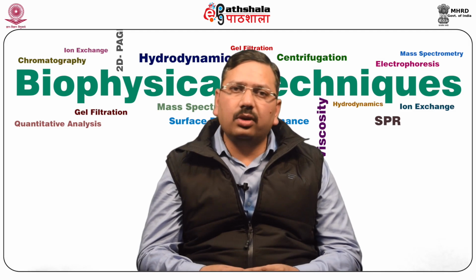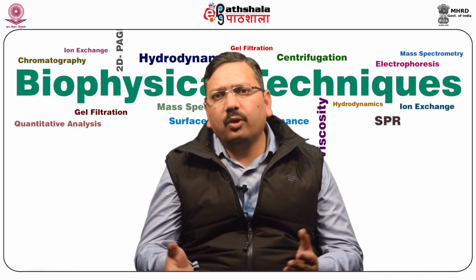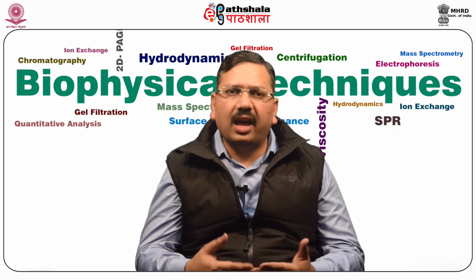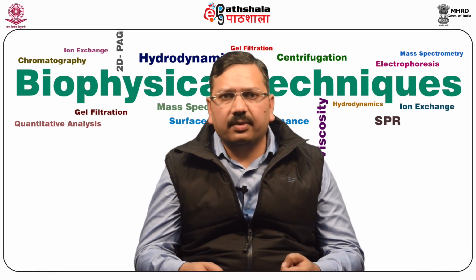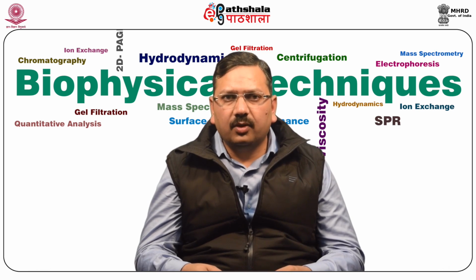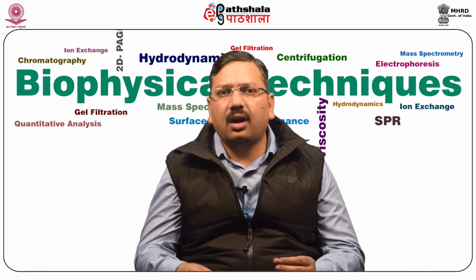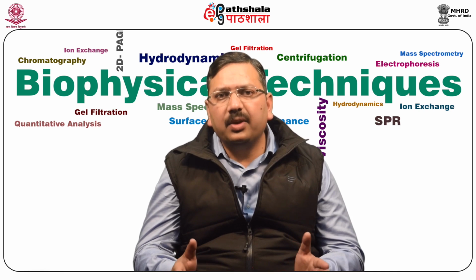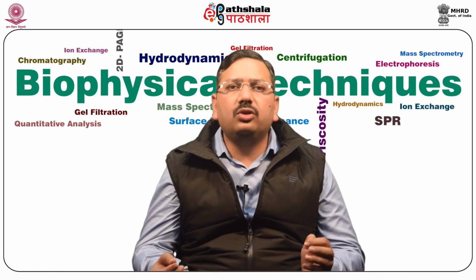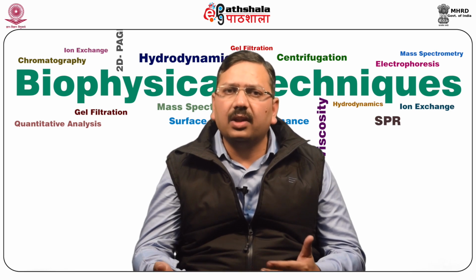Now coming to the advantages of MALDI, or why MALDI is utilized for the majority of proteomic experiments, which generally happen in day-to-day life or for biological identification of proteins. Firstly, this is a totally automated system. Second, the sample can often be used directly without purification after in-gel digestion. That makes life very easy. Third, it is very good for sequenced genomes and it rapidly gives you data after identification.